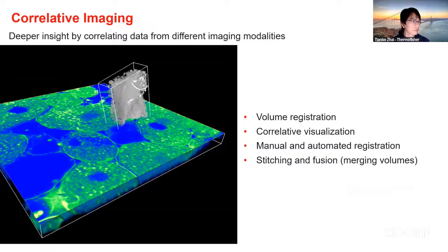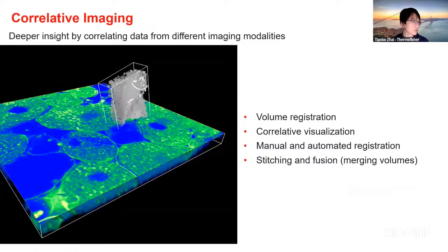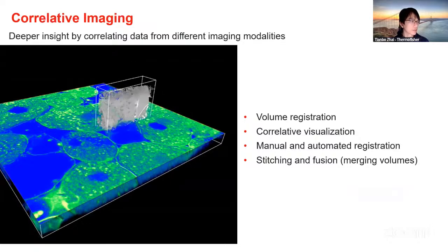So inside the software, in the context of AMIRA, this is called registration. Essentially, we're trying to register a primary image with some new images. They could be of different size, different modality, but they may share some of the fundamental key structures.